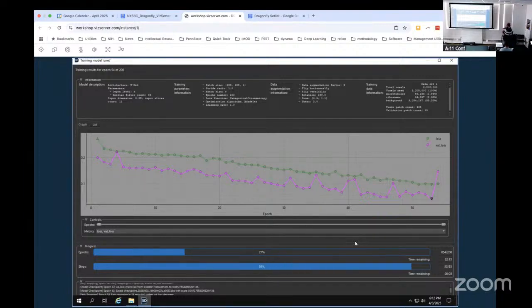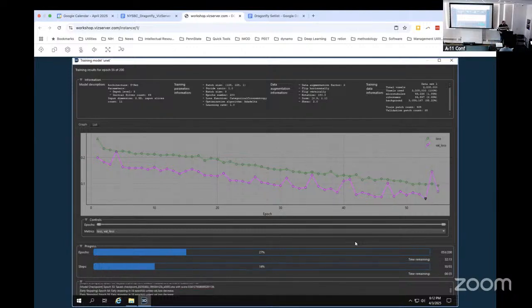Then we also had to do some weird things. Oh, it gets really weird. So maybe not. I also do have that in select, so you can do that, so that it looks like that.